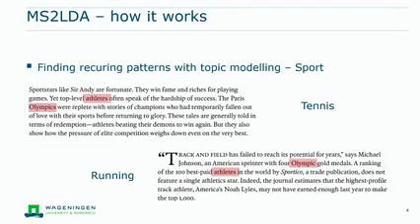But what is behind this? What is the algorithm that works in MS2LDA? And this is topic modeling. So this was developed some time ago, actually. It is not new, but it helps us to find patterns.